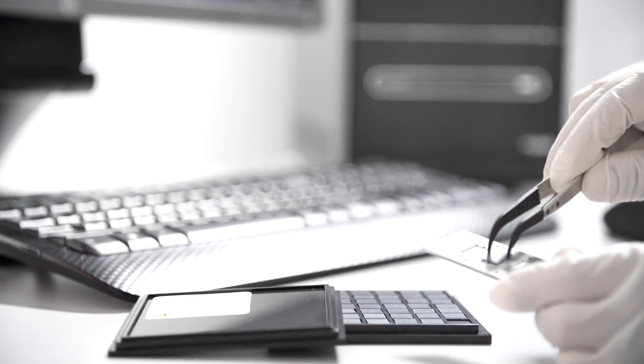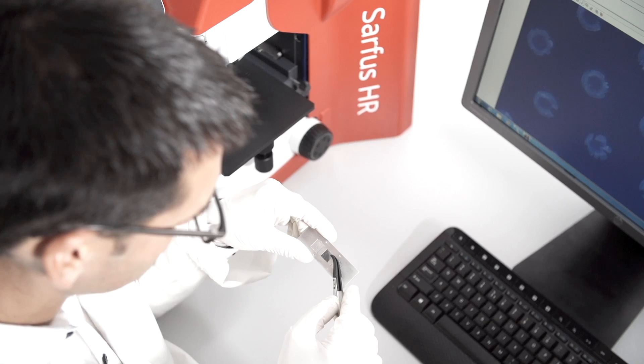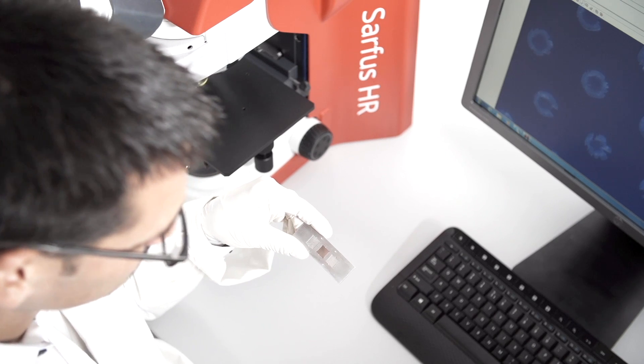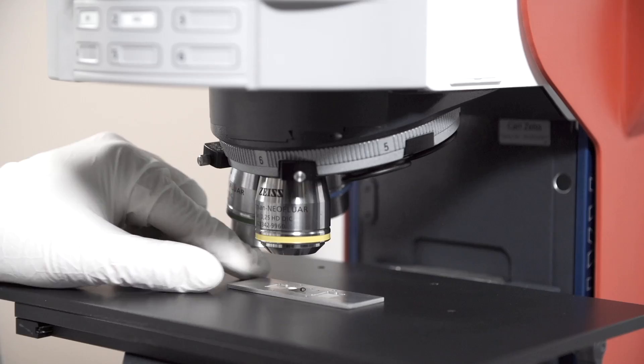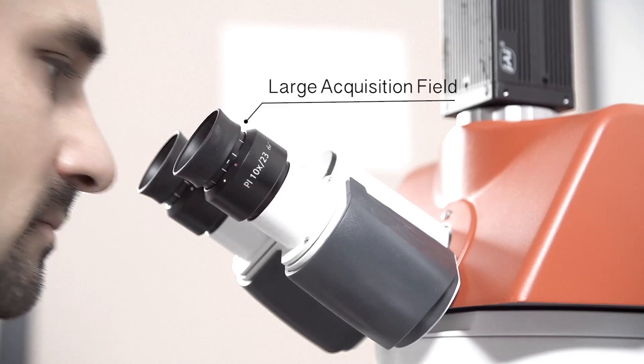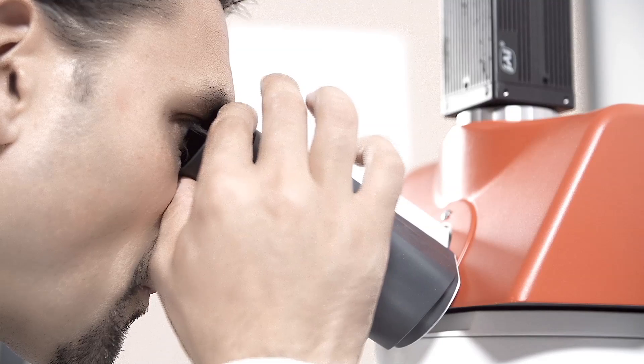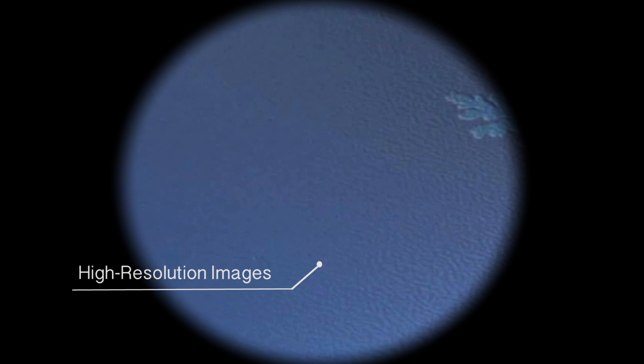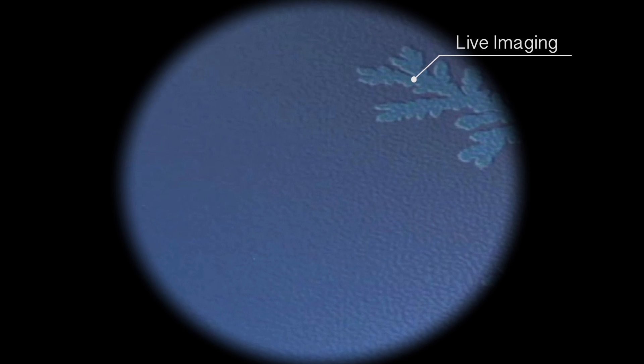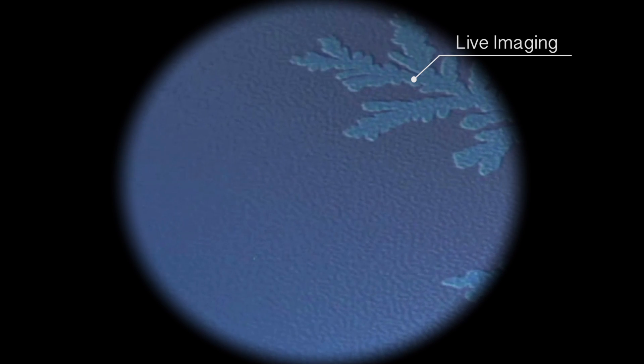The Surface HR system is an optical system with a unique combination of acquisition mode capabilities, non-contact analysis to preserve the integrity of your samples, a large range of acquisition fields from square millimeters to square micrometers, and live imaging of your samples for kinetic studies.